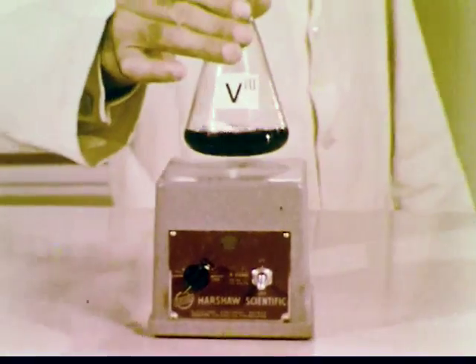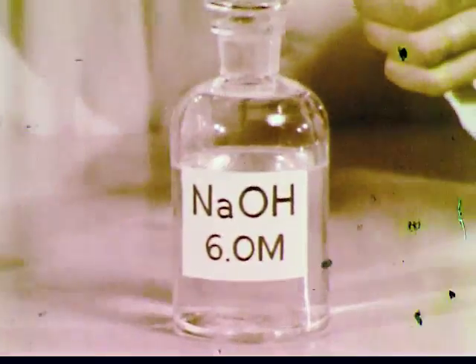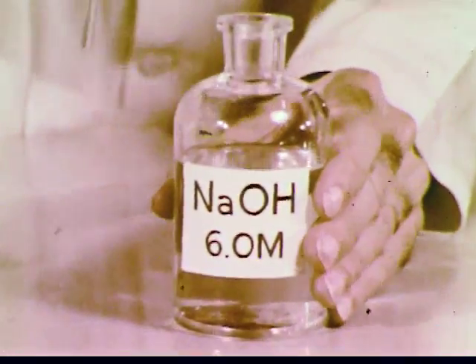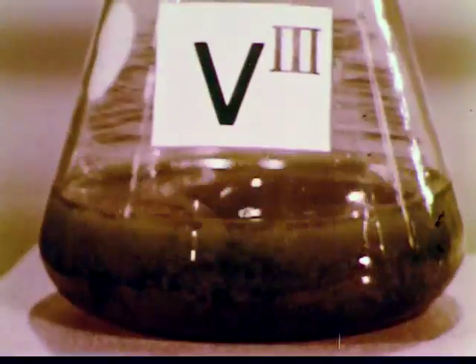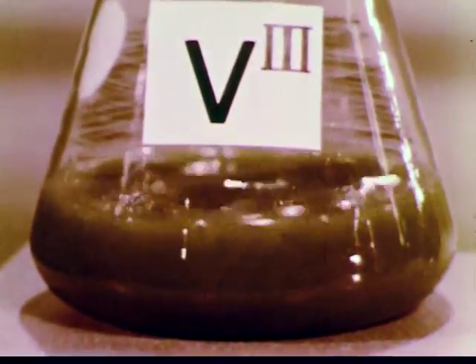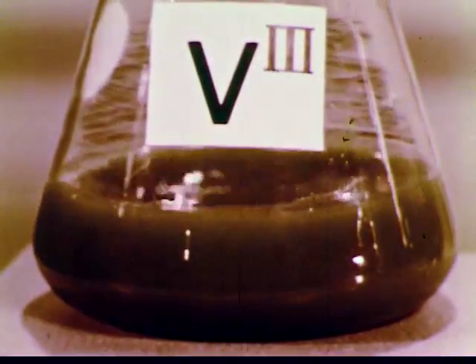Now let's investigate some of the chemical properties of vanadium in its several oxidation states. We place some green vanadium-3 solution on a magnetic stirrer. Sodium hydroxide is added to the vanadium solution. The precipitate that is forming is the hydroxide of vanadium-3. The magnetic stirrer disperses this as fine particles of suspended material and gives a muddy appearance to the mixture.